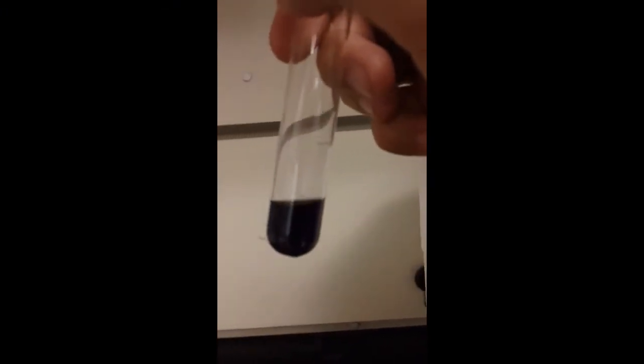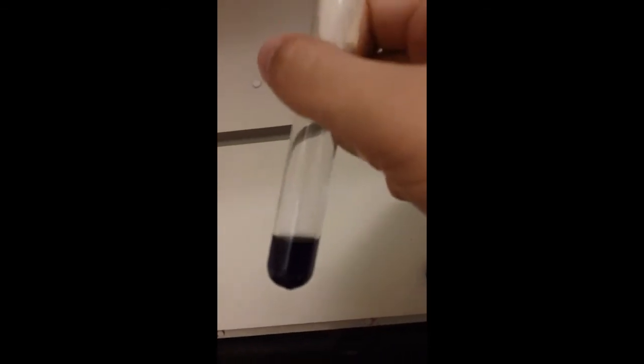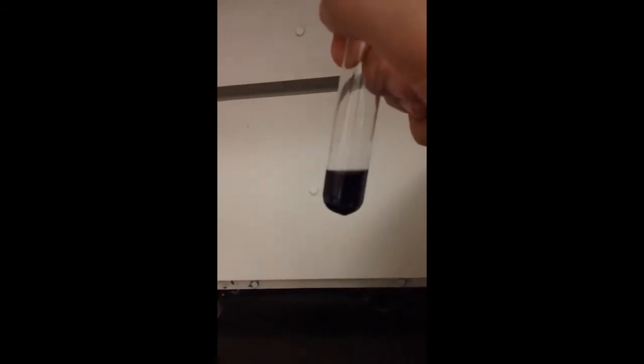10 drops. Gently shake. Oh, look at that change. Okay, so record your changes down. This is test B for your unknown. Step 4, test B.